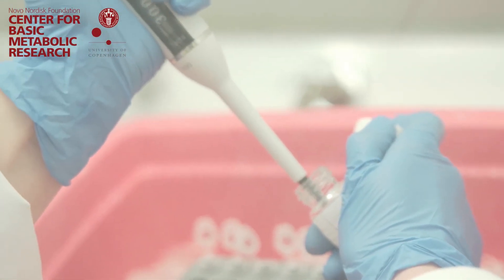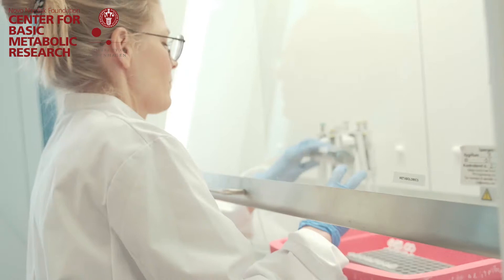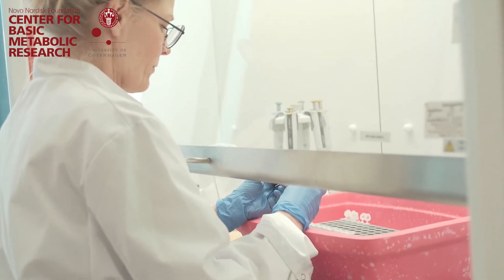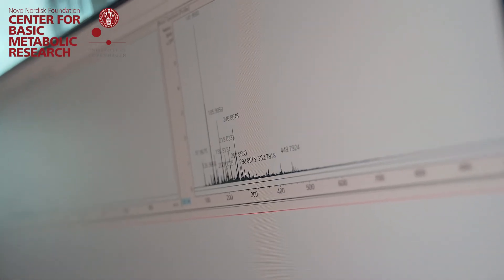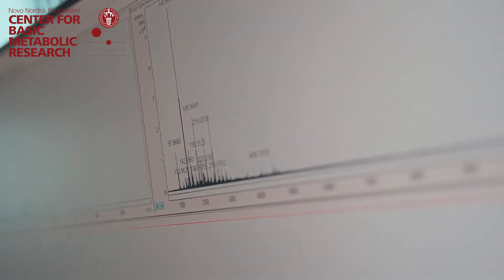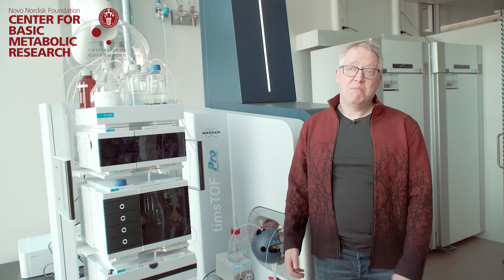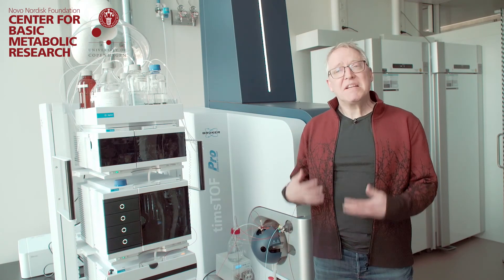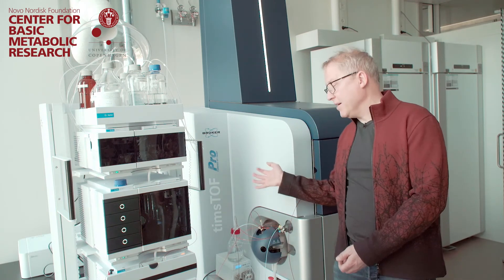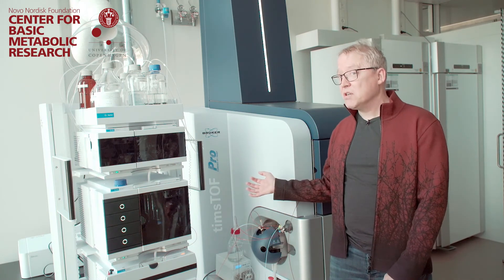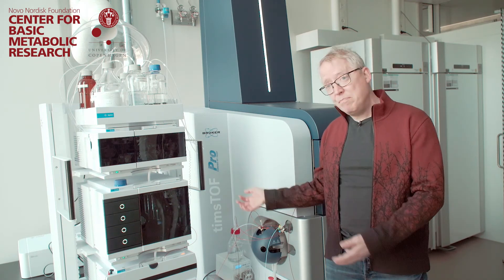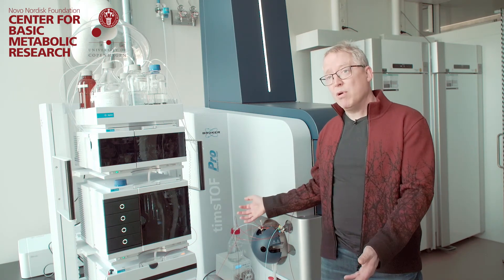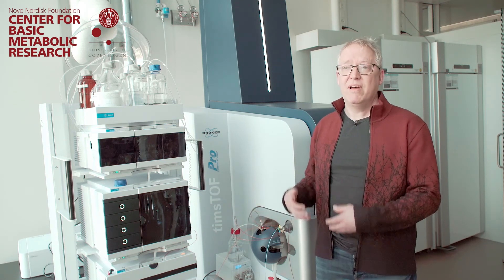We start with the extraction, extracting the largest number of metabolites possible. The process should be reproducible, unbiased as possible, and not degrade the metabolites. To analyze the samples we turn to the instruments in this room. Depending on the questions, we are using different kinds of instruments. All of these are mass spectrometers though. On my right side here, we have an LC-MS instrument which we can use for analyzing lipids, metabolite profiles and many other types of applications.